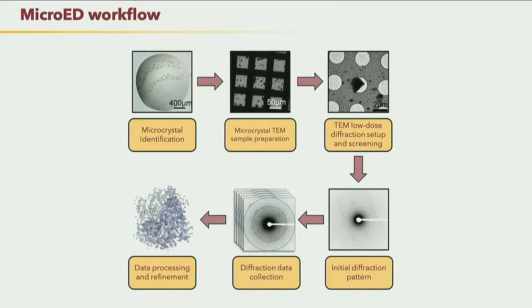So this part of the workflow is very familiar to anybody who does cryo-EM, and this part of the workflow is very familiar for anybody who does crystallography. So no matter which side you're coming from, there's going to be part of the workflow that seems very familiar to you.